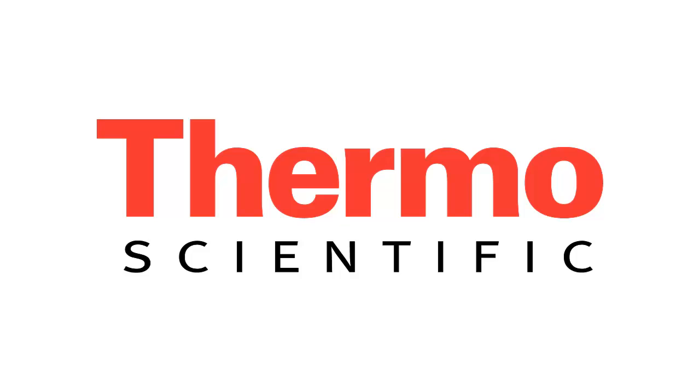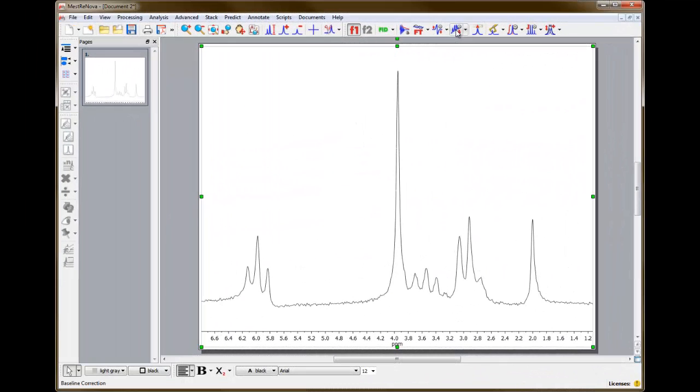In part 3 of this tutorial on basic processing techniques of picoSpin JCAMP data using the Mnova NMR processing software, we're going to cover the subject of phase and baseline correction. Let's start with phase correcting our spectrum.